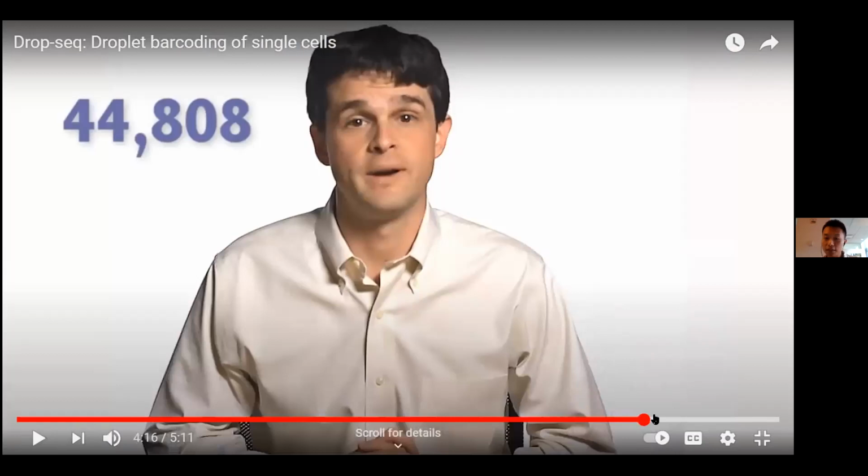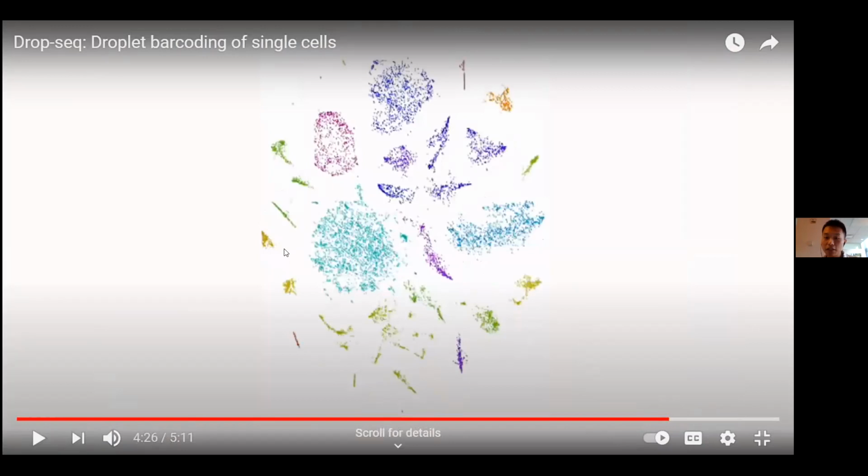Okay, and this is their retina experiment. This result actually identified lots of cell types that we didn't know before. Currently we still don't have that much information on what exactly all these cells are doing in the retina. But it's a very first step that we can see, okay, there are lots of different cell types in our retinas.